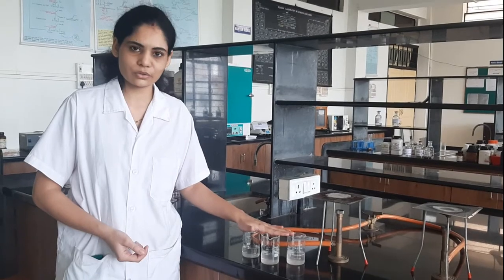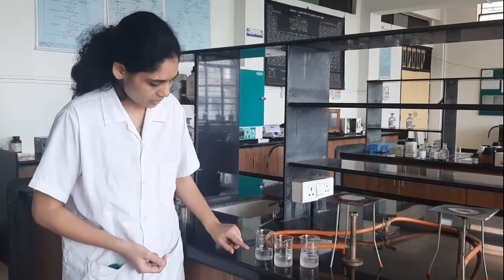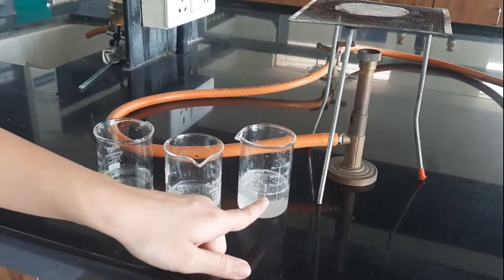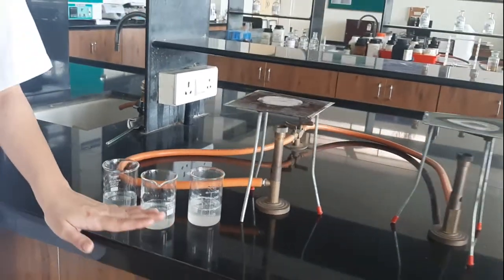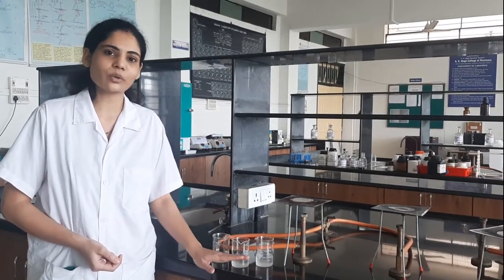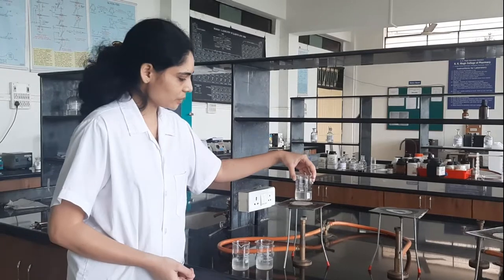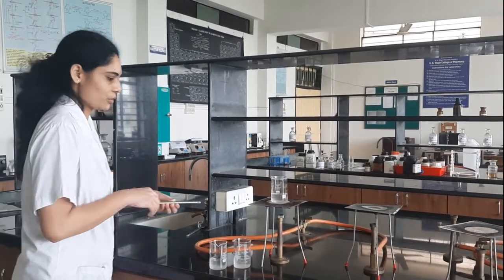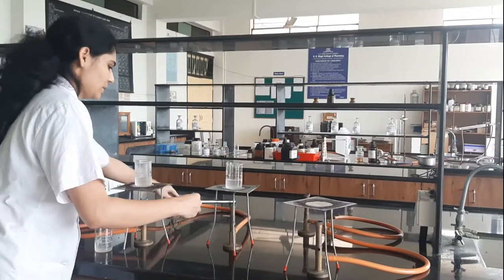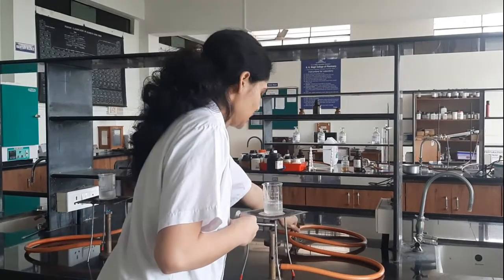Now we will start with our next part. We have taken three beakers of the same radius. In them we have prepared NaCl solution. As you can see here, this is 10% NaCl solution, this is 20% NaCl solution, and this is 30% NaCl solution, right? Now we are going to heat all of these three beakers at the same time for the next 10 minutes, and then at the end of 10 minutes we will determine what volume remains in the beakers, right? Now we will proceed with the practical. First, this is our beaker which contains the 10% solution of NaCl. Now we will start heating it. This is our next solution which contains 20% NaCl. And this is the last beaker containing 30% NaCl solution.